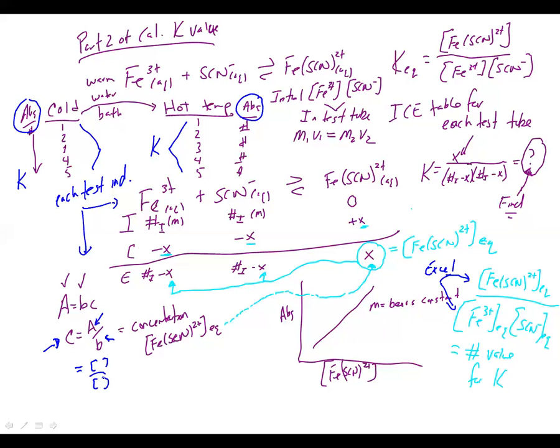Once it calculates those concentrations, you can put a formula into Excel that is the equilibrium expression, and you can have Excel calculate K for you as well. So you need to put each of those values into Excel in columns, and then use formulas, and you could have Excel calculate both the concentration using Beer's constant, and K as well. But you would have to input the numbers into Excel, or copy them over into the proper columns, and then do some formulas. Other questions on that?